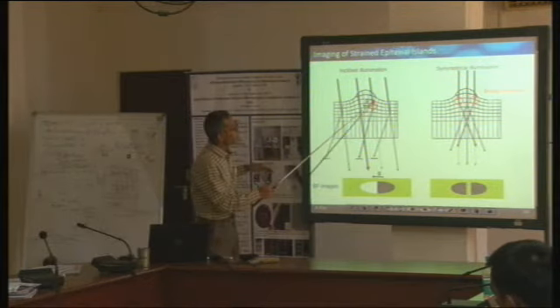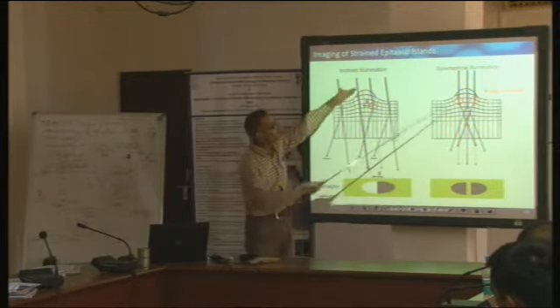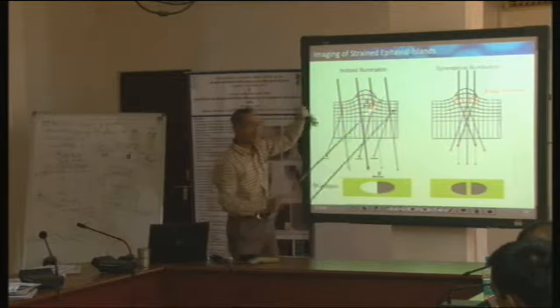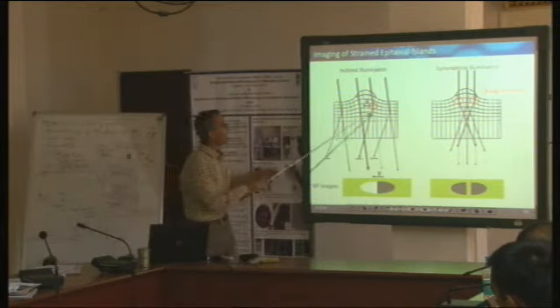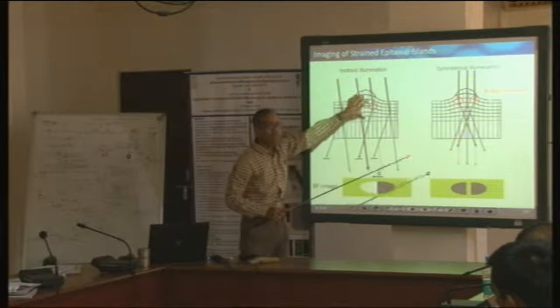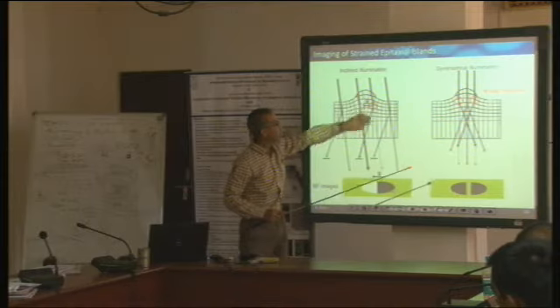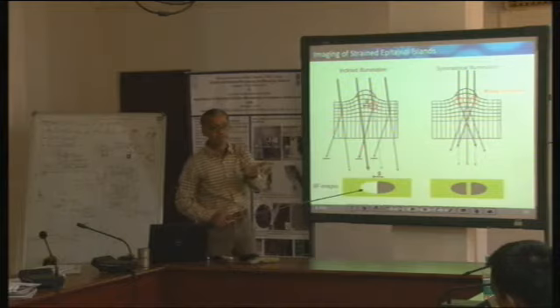So here you look at this particular area, and let's assume that here it is an inclined illumination. It's not symmetric illumination like this. And suppose this inclined illumination has been deliberately so inclined that this part of the sample, in the vicinity of this quantum dot, this part of the strain field, satisfies the Bragg diffraction condition.